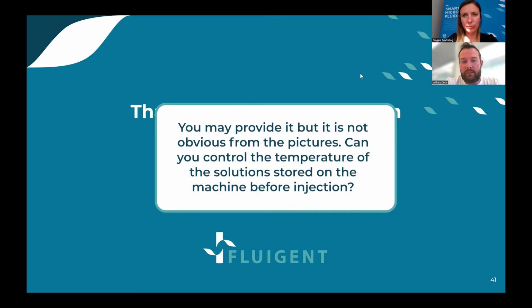What you can do, maybe if you want your solution to be really heated when it enters the chip, is to have your chip inside the incubator and have the tubing long enough so that it gives time for it to be heated before reaching the chip. But right now, no solution for heating really the input solution. But we are developing it, or we are thinking of developing it.